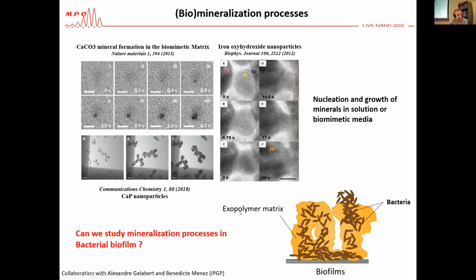But so far, nobody has studied the mineralization process directly in the biofilms. And that's what we try to do in collaboration with Alexandre Gelabert and Bénédicte Ménez from the Institut de Physique du Globe de Paris. We try to meet this challenge with the idea not to observe live cells. I told you it's not possible, but to use them as a template to see the effect of their surface and the exopolymer that they secrete in providing nucleation sites for mineralization.